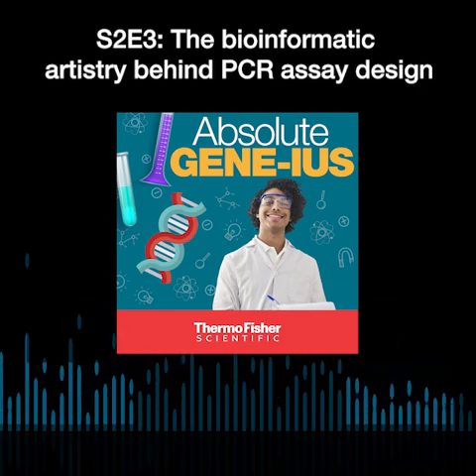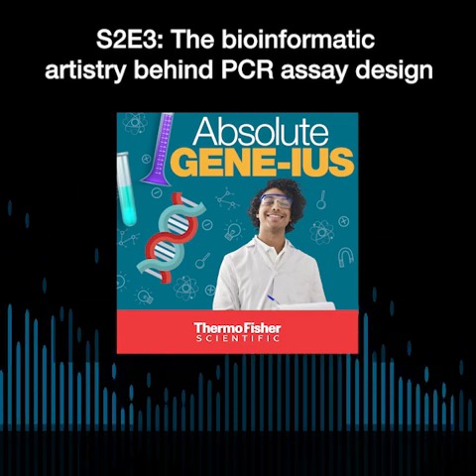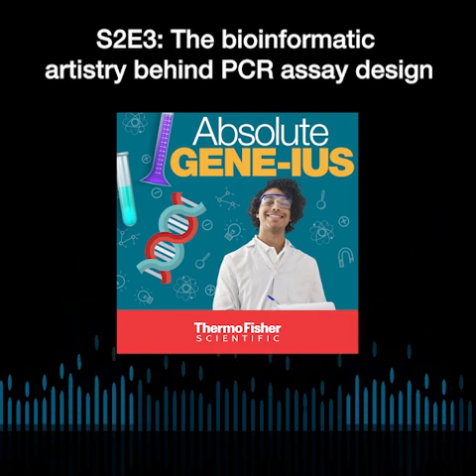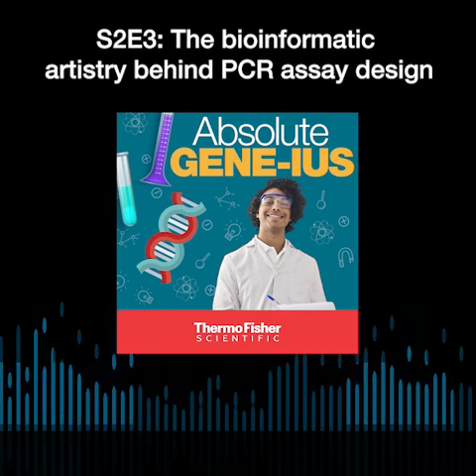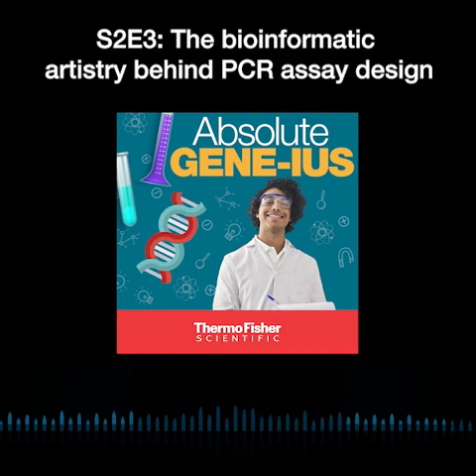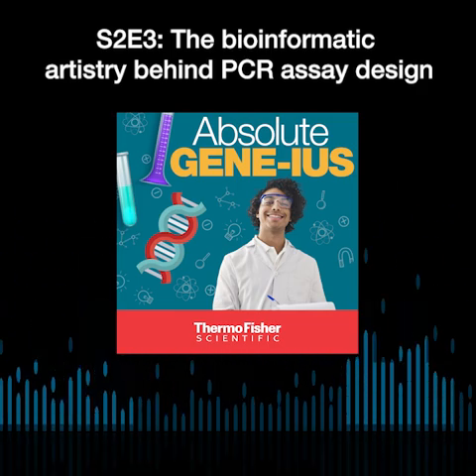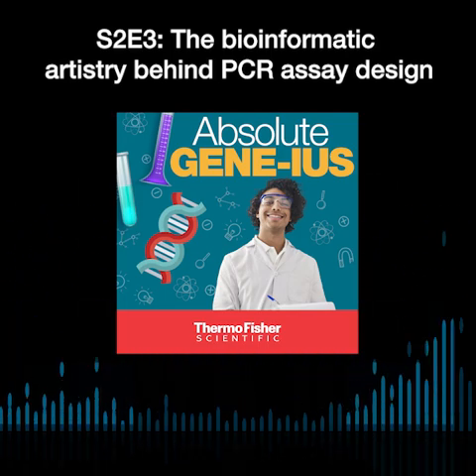So it's important that we select our controls according to the target in mind. If you have a somatic mutation, then people do end up using synthetic strings in the sample as a control, or you might use a Ceph DNA. And when it comes to population-wide variation, make sure that the control you're using does not have the underlying mutations.